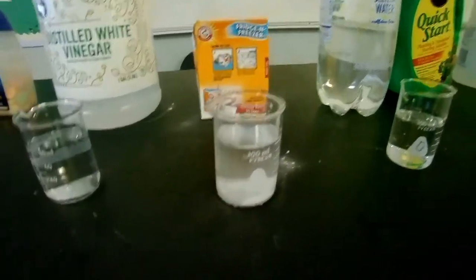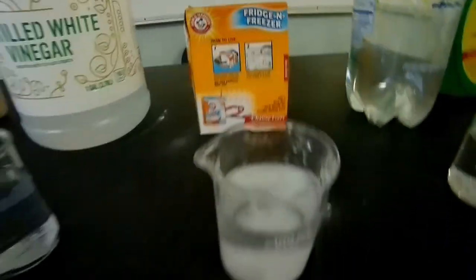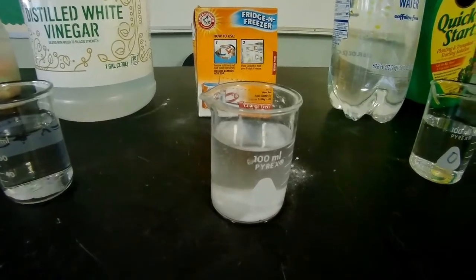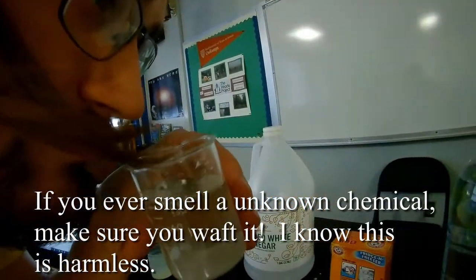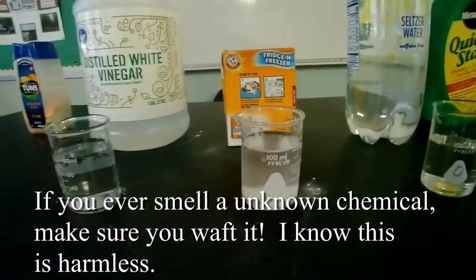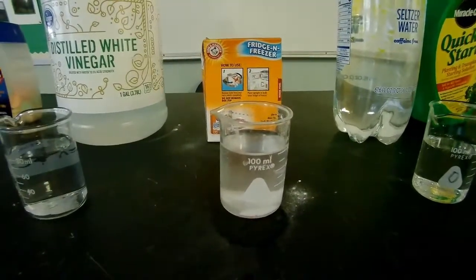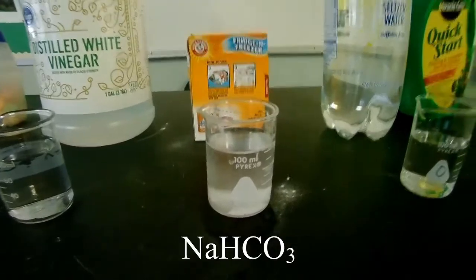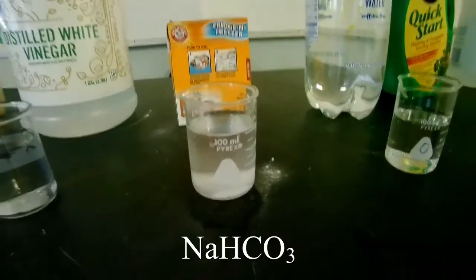All right, our next contender is going to be baking soda. You've probably seen this in the supermarket before. And I've dissolved it again in water here. This one seemed to dissolve a little better in water. And if we talk about its smell, it doesn't have much smell to it at all. All right. The chemical formula for this one is Na, which is sodium, HCO3. So maybe that'll give you a clue if it's acid or a base. So let's make our predictions and write down our description.